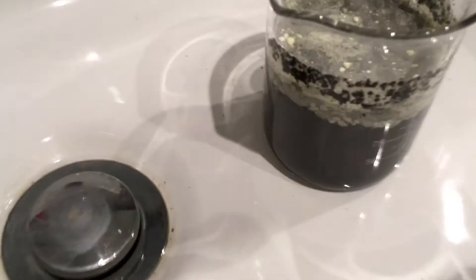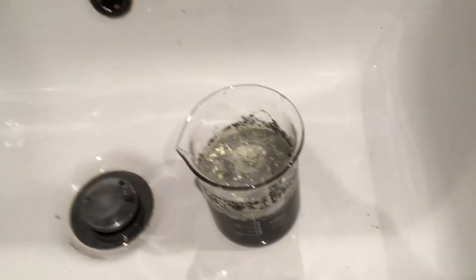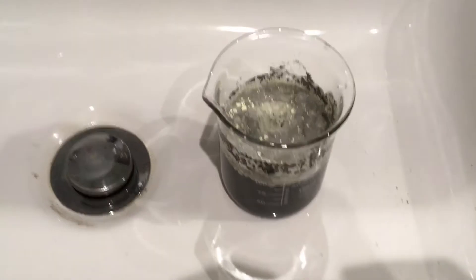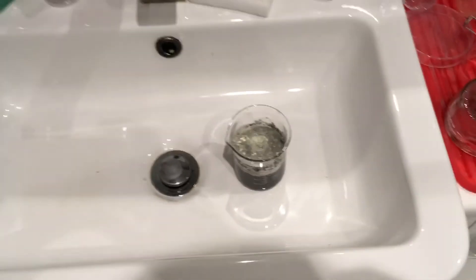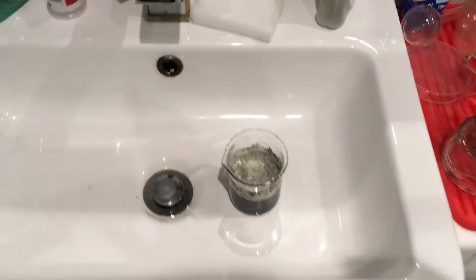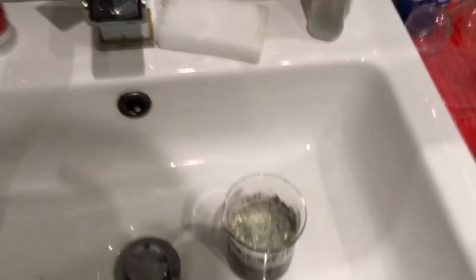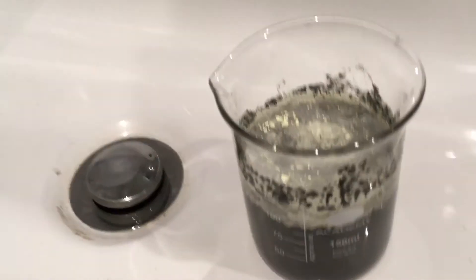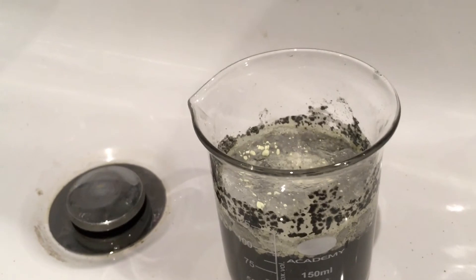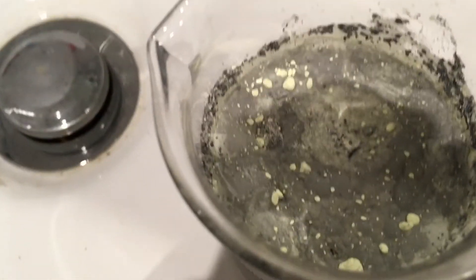We get to this point in the experiment where it's separated. There is this murky layer and there's the sulfur on the top, but what I really didn't want to have to do — I'm going to have to stop the experiment, because it just smells so horrible. The ventilation isn't very good, and there's just this smell of sulfur everywhere. It's just horrible, it's just not nice.